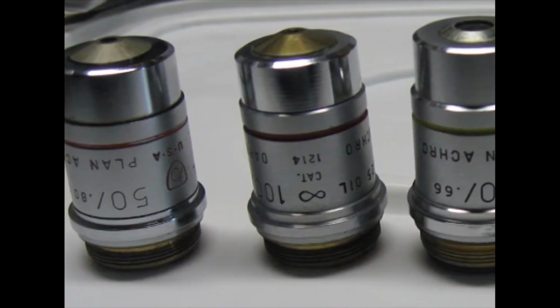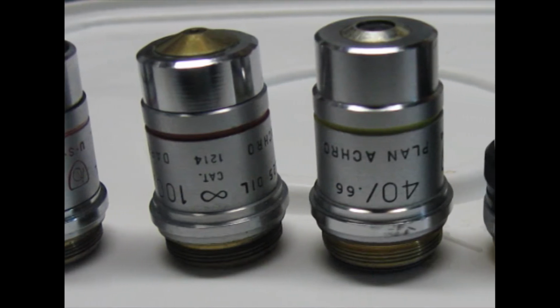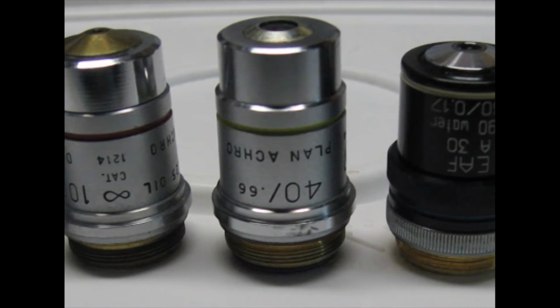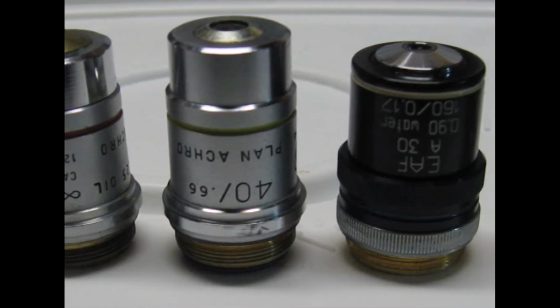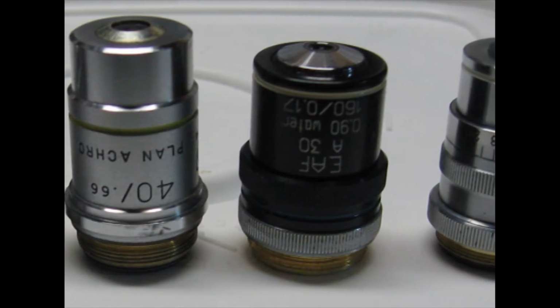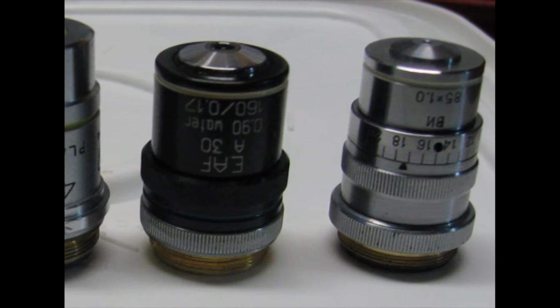Magnification is the first principal function of the objective. The magnifying power of an objective is called its initial magnification. The magnification is usually marked on the metal surface and ranges from 1x to 100x. Objectives may be classified according to their magnification into low, medium and high power.